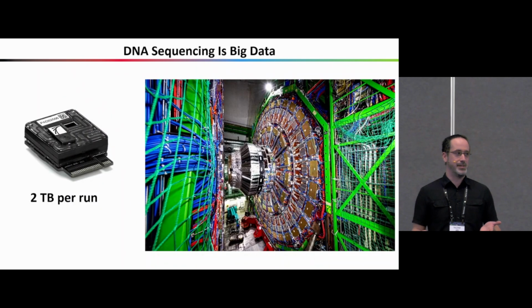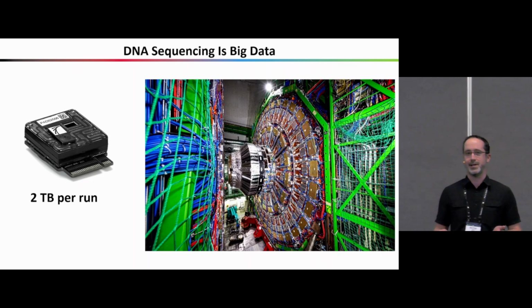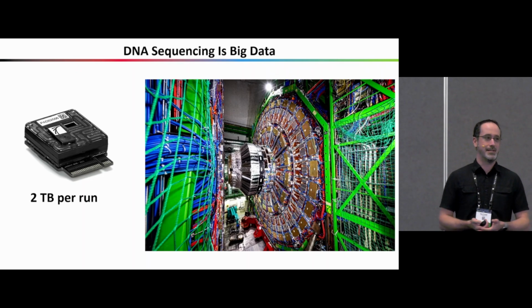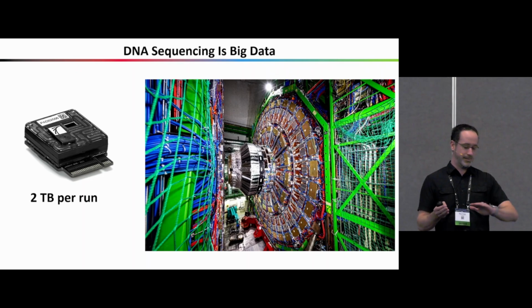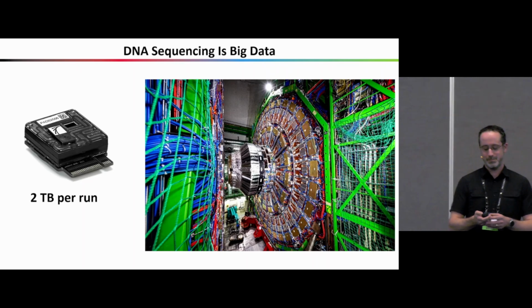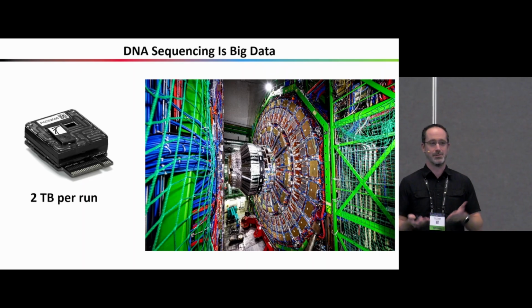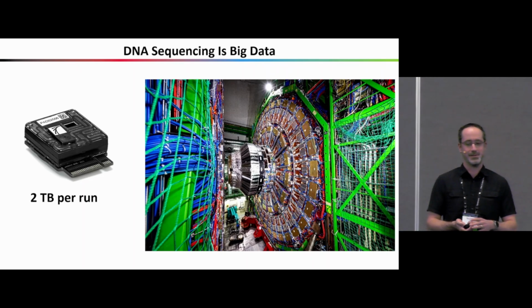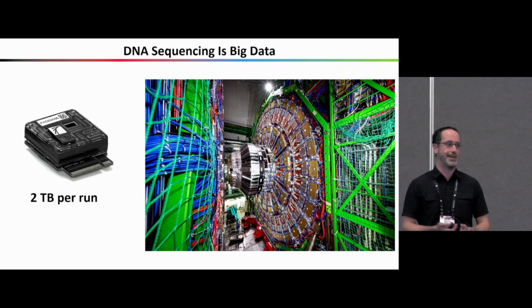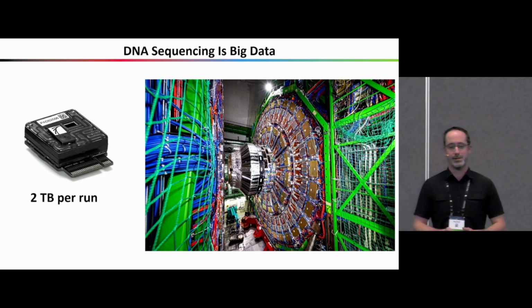That's as far as we got with the million specimen tests so far, because the data is really big, and it's so big that DNA sequencing is almost now more akin to something like the Large Hadron Collider, where you do a relatively quick experiment and then you end up with just a ton of data that can take months to go through. So we're still analyzing that because it is hard. You can't even open a folder on a computer with 1 million files or open an Excel file with more than 1 million rows. So the data is a bit challenging to work with, and that's just something as a community we're going to have to figure out ways to deal with, given the large amounts of data these sequencers are now producing. But that's a good thing overall.